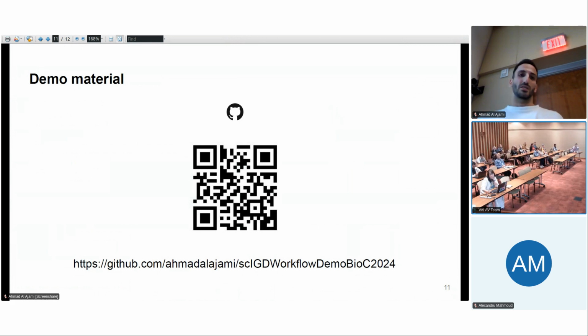But one quick example you could think of is HLA loss, especially in tumor cells and tumor samples. Imagine that. This tool would allow you to see which of the HLA the tumor cell, for example, has lost. So if you have a tumor data set, you can load it into here. Then you can compare immune cells against tumor cells. In an ideal world, you would see both alleles in tumor cells and immune cells. But in HLA loss examples, you would see two alleles of one gene on an immune cell, but you would see only one allele on a tumor cell.